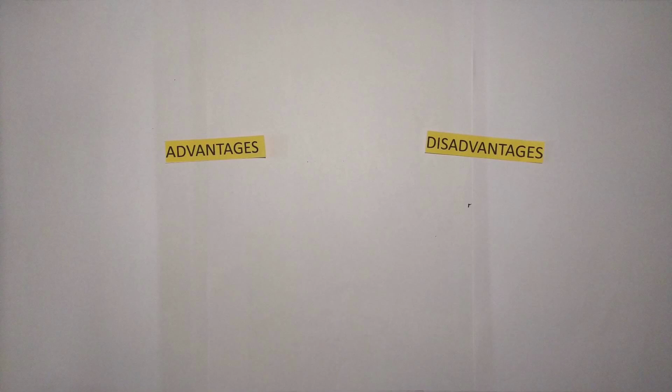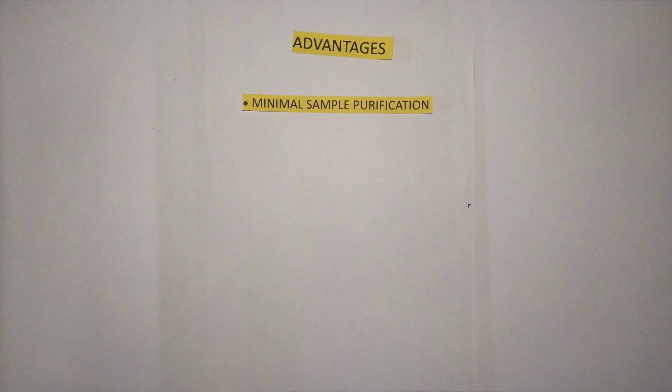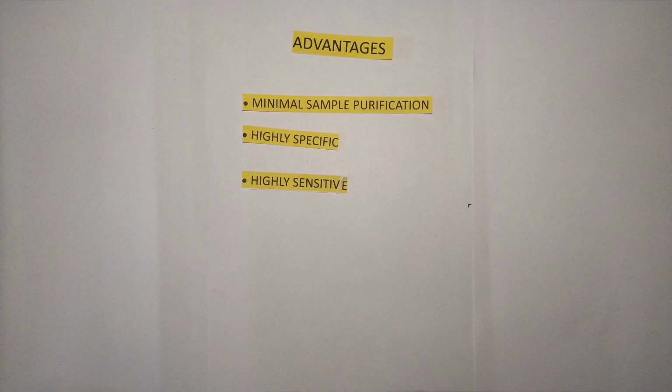Let's see the advantages and disadvantages of sandwich ELISA. First, we'll see the advantages of sandwich ELISA. First, minimal sample purification is needed. Second, it is highly specific. Third, it is highly sensitive.